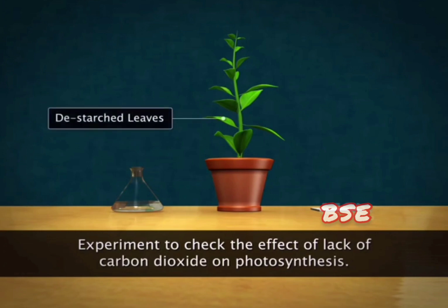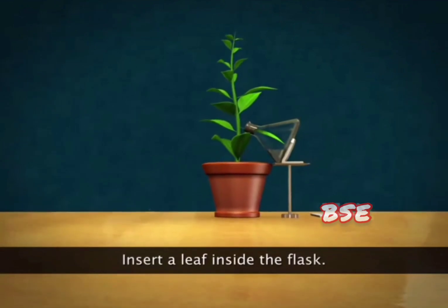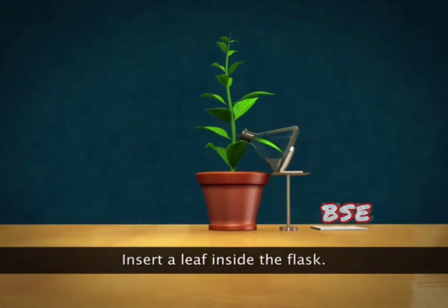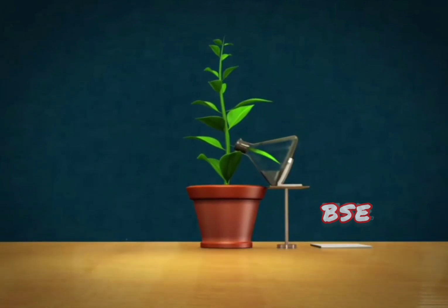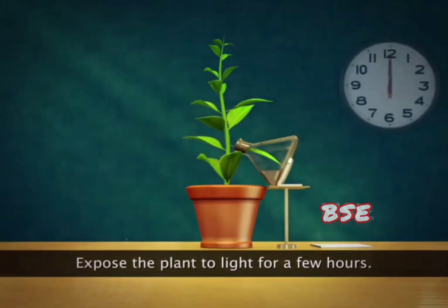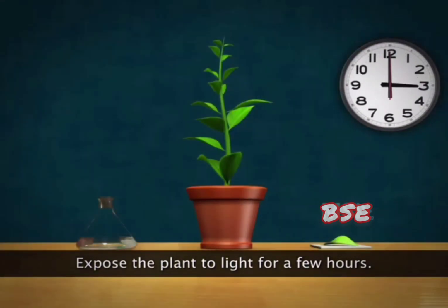Take a plant with de-starched leaves. Take a conical flask containing some potassium hydroxide, KOH solution. Insert a de-starched leaf into this conical flask through a split cork on the mouth of the flask. Leave this set up in light for a few hours. Then remove the leaf from the flask and test it for the presence of starch.